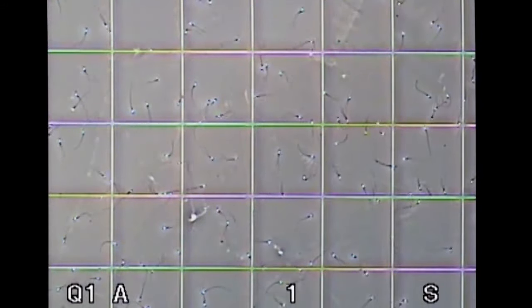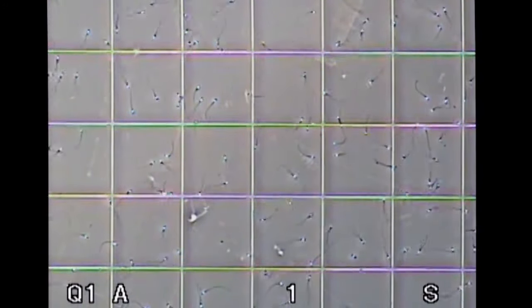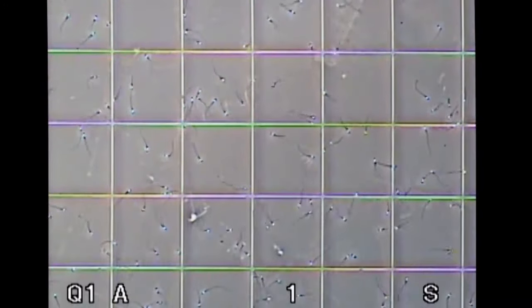The motility percentage is determined by calculating the percentage of sperm on the grid that are actively swimming.